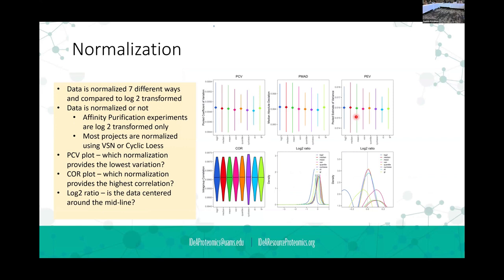So let's talk about normalization. These graphs that I have out here to the side, I'm really just going to refer to these two. There's a lot more graphs and metrics that come out through this package than what we really focus on. But every week, we have a meeting and we go over every project that we have completed from the week before. We go through all of these plots together and we look at them to decide how the analysis went.